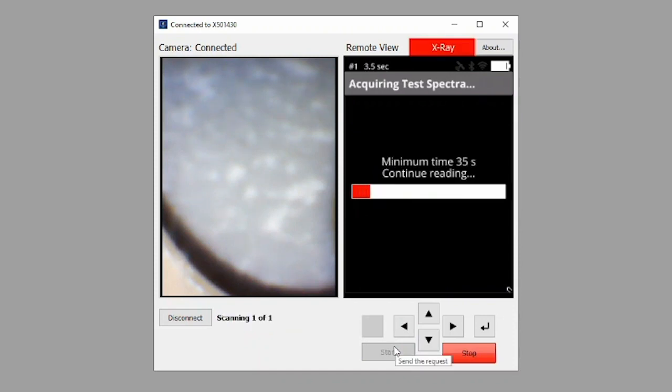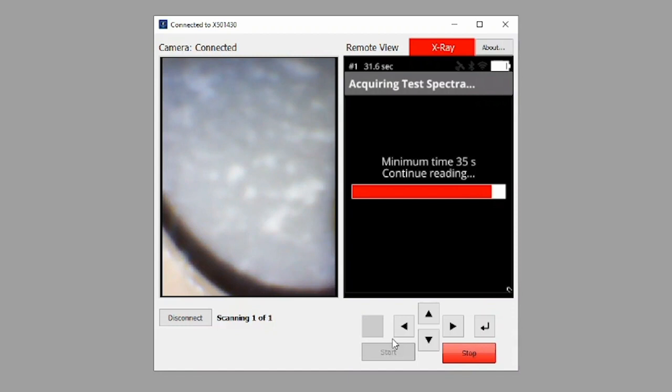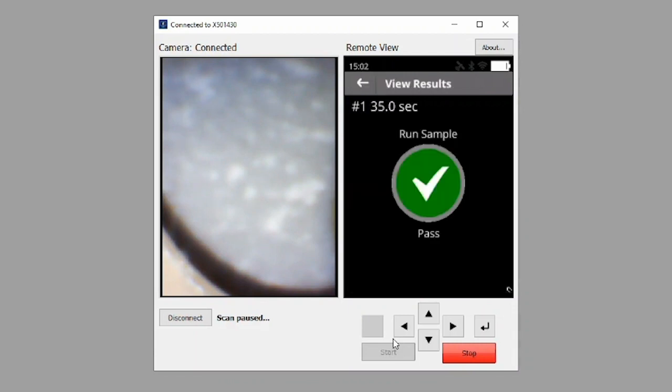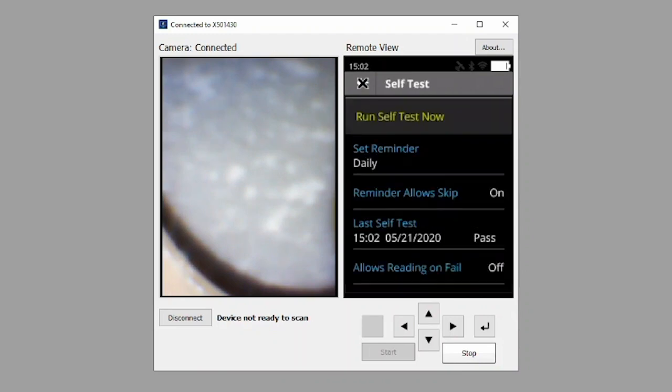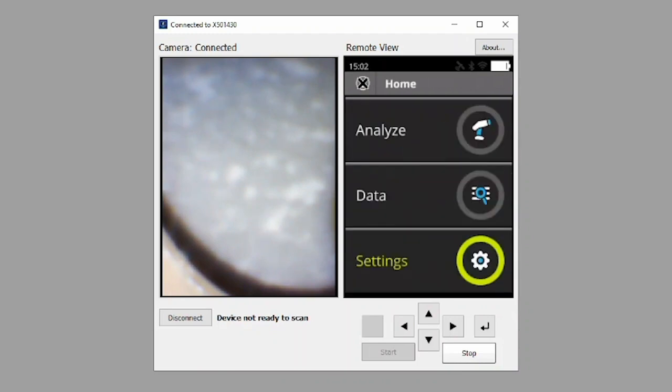Note on the left side of the screen there is a live camera image of the sample in the compartment. This lets the user know if the sample has been properly seated. Once analysis is complete, we are presented with the results screen. Here we see the instrument has passed the daily self-test. Click the back arrow icon at the top of the screen three times to return to the main menu.